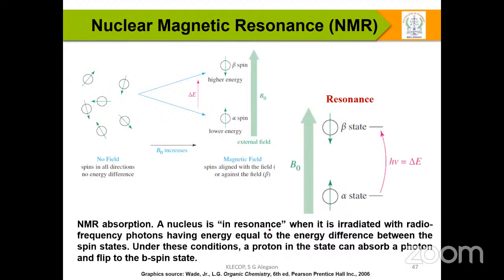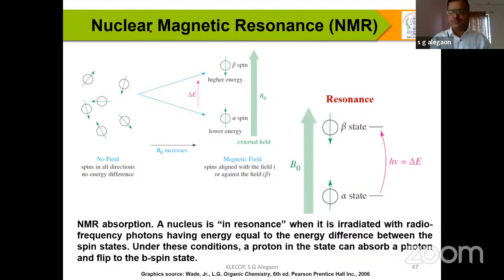A little bit of theory, or some principle. Most of the time people ask what resonance is and how NMR works. If you remember your childhood, you might have played with a normal magnet. Okay, I'll open this video and show something.